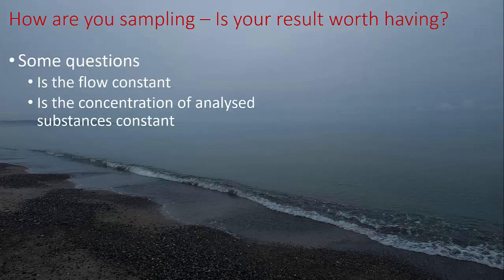Is the flow constant? Is the concentration of analyzed substances constant? If not constant, how do flow and concentration vary? Answering those questions will also guide you to the correct sampling methods. What sampling methods do we have?